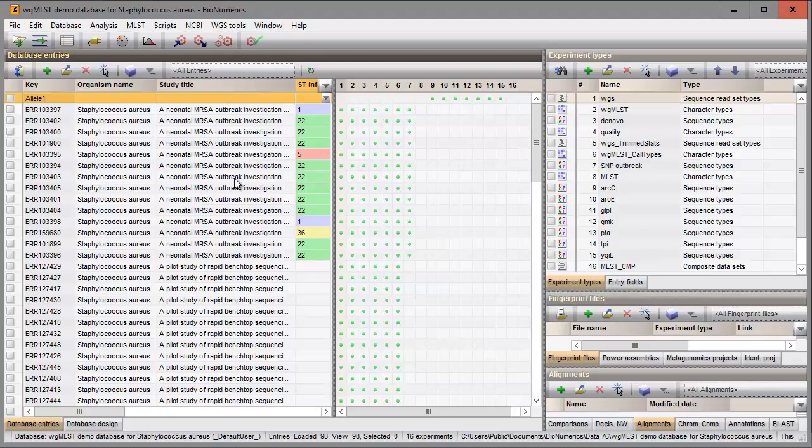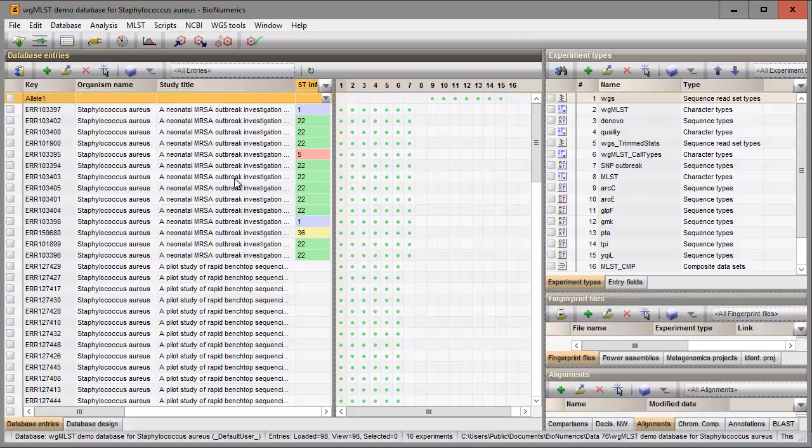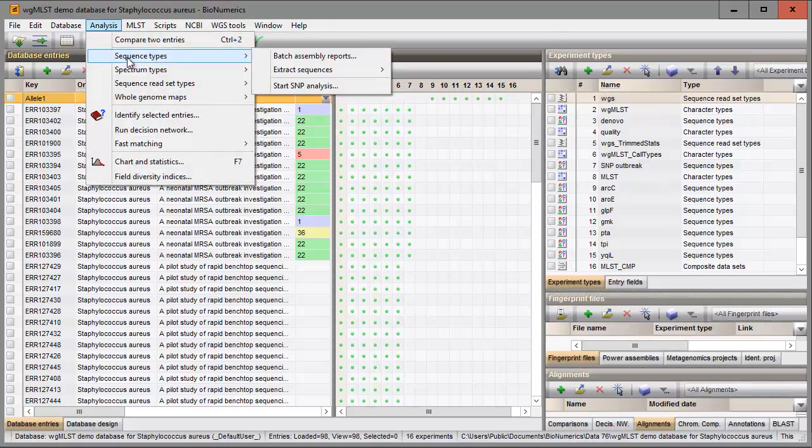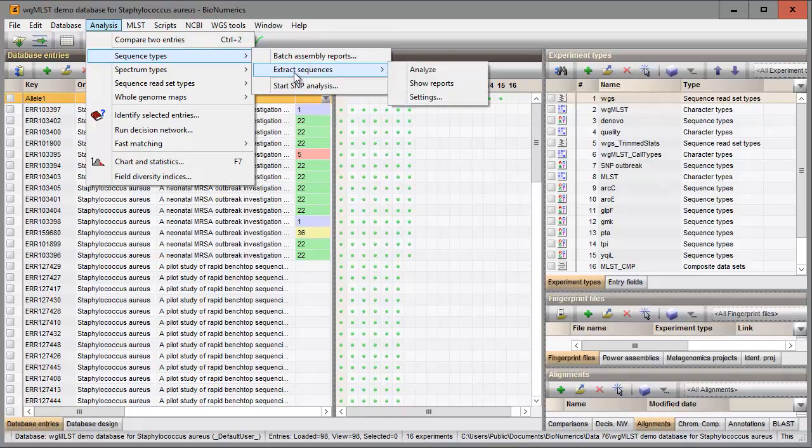Now that the plugin is installed, I need to specify some settings before I can extract the sequences. I go to analysis, sequence types, extract sequences and then settings.